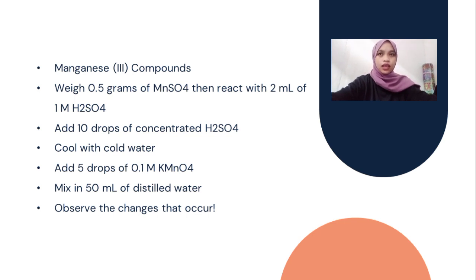H2SO4. Next, add 10 drops of concentrated H2SO4. Next, cool with cold water. Next step, add 5 drops of 0.1 molar KMnO4. Mix in 50 ml of distilled water, and last, observe the color change.